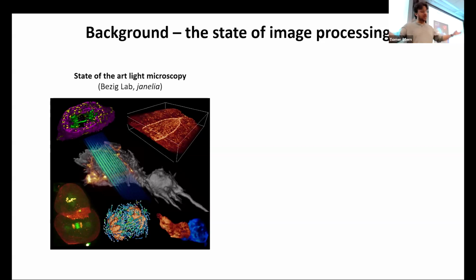Forever, right. And we're living in a great time to be doing this science, because over the last 10, 20 years, microscopy reached the point that we can image whole embryos every few seconds at submicron resolution, which gives us literally a direct view of everything that is happening in the embryo.